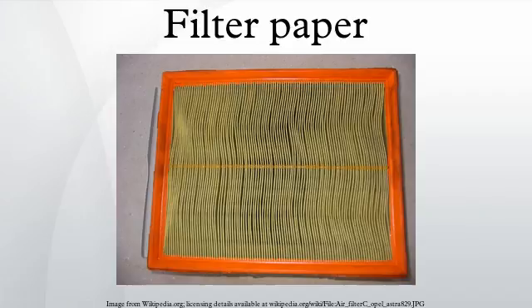Filter paper is a semi-permeable paper barrier placed perpendicular to a liquid or airflow. It is used to separate fine substances from liquids or air. Properties: filter paper comes in various porosities and grades depending on the applications it is meant for. The important parameters are wet strength, porosity, particle retention, flow rate, compatibility, efficiency and capacity.